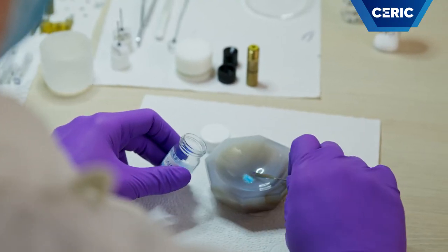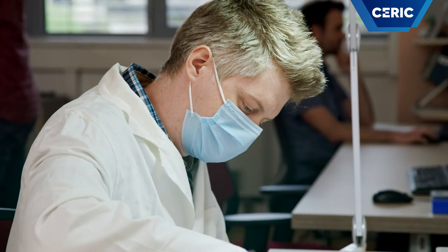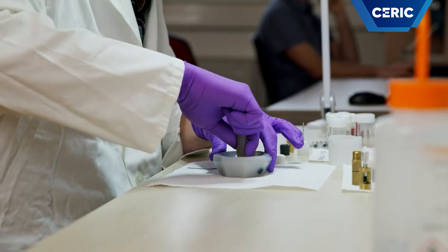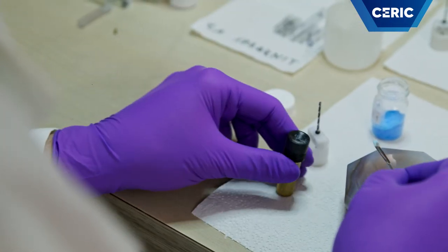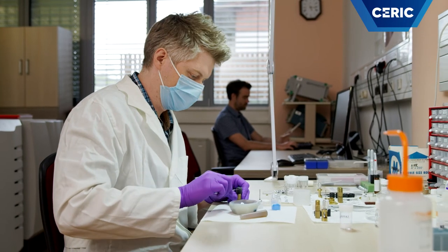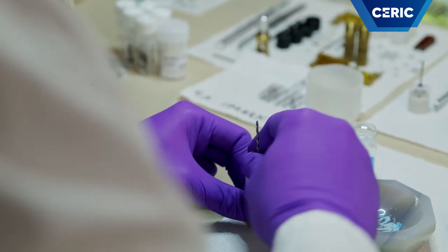We only spin very fine powders. If the obtained samples are not such, if they contain large particles, we grind them. We put fine powders into tiny ceramic tubes, which we call rotors. We try to fill as much sample as possible and as homogeneously as possible into the rotor. Namely, the intensity of the NMR signal is proportional to the number of the detected NMR active nuclei, so the more sample we observe, the stronger signal we detect.